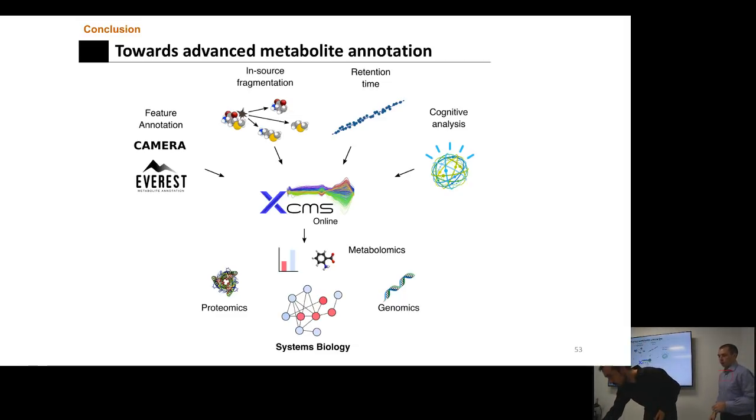So just to jump back on that quickly, from the plot of that retention time deviation, what you're looking for is that you have plenty of well-behaved peak groups, anchors across that retention time alignment, and that retention time deviation, so down that y-axis, is an acceptable range of what you're wanting.